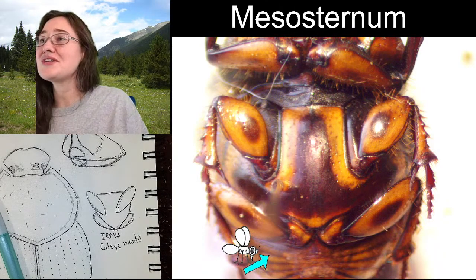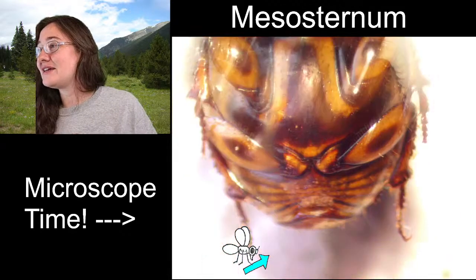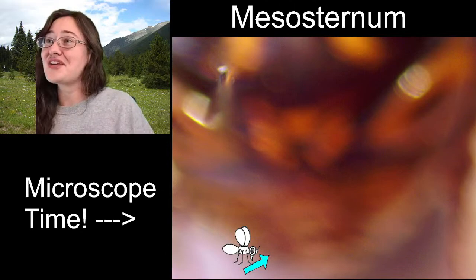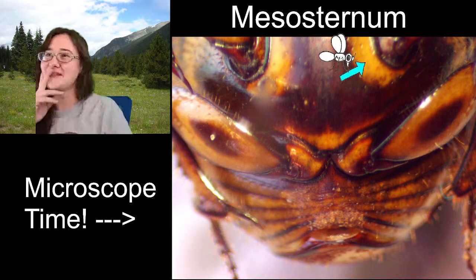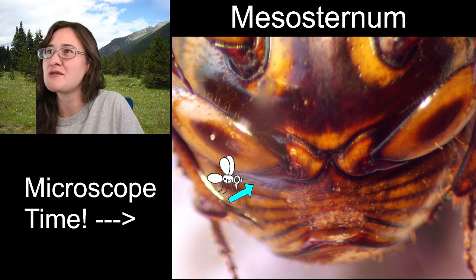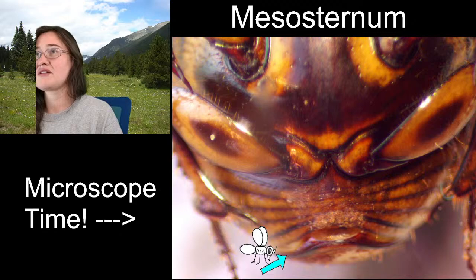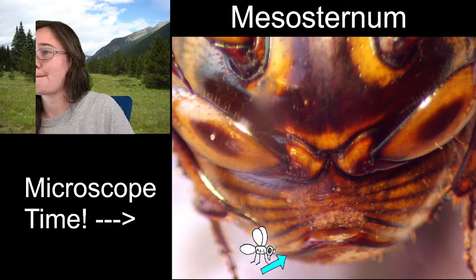So, I told you we were going to see the end of the abdomen and how cute and adorable it is, because look how tiny. As a little kid, I never would have guessed that the abdomen could be so small in comparison to the body, because I always figured that the abdomen started way up here when I was a kid. And then to see something like this where I believe they are five-segmented abdomens. 1, 2, 3, 4. I mean, that makes it look like 6. I know that all scarab beetles have the same number of abdominal segments. Well, I thought so. Maybe not.